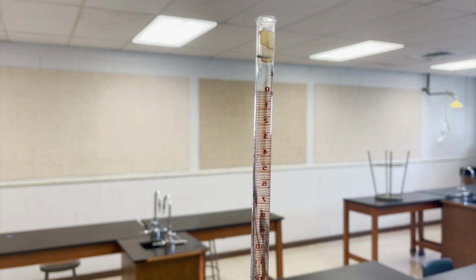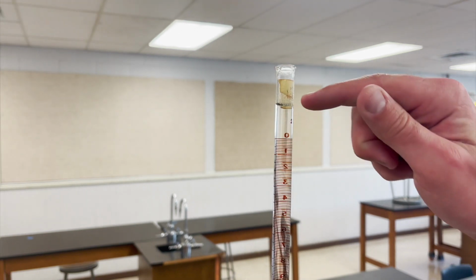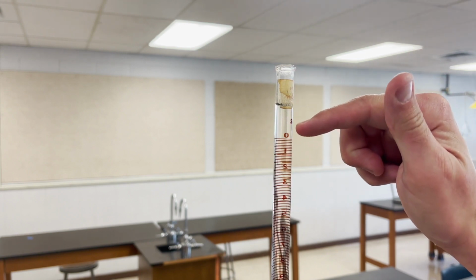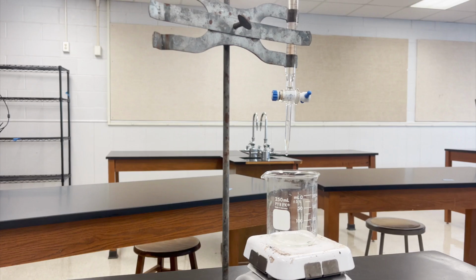Again, this is a 0.100 molar solution of sodium hydroxide. But what we need to do is bring it down to the 0 mark, and so I'm going to use my extra beaker to do that.